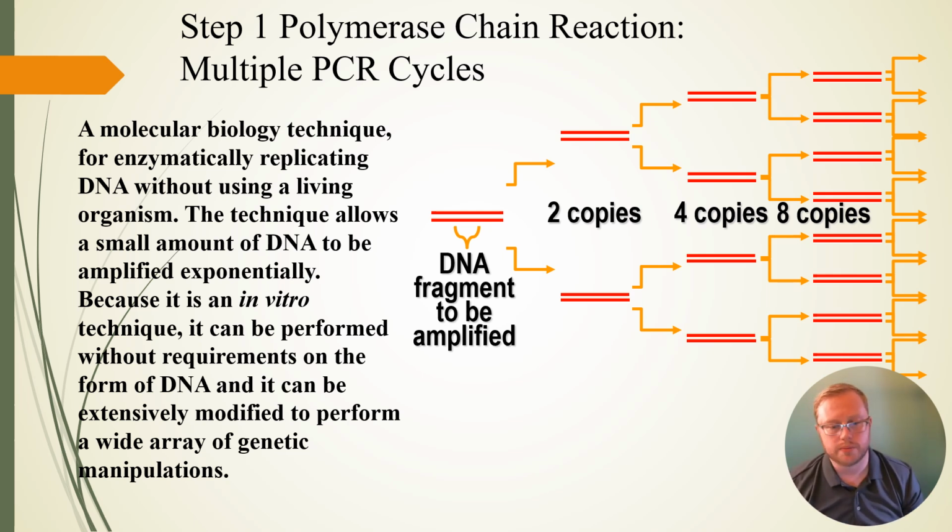This is a molecular biology technique for enzymatically replicating DNA without using a living organism. The technique allows a small amount of DNA to be amplified exponentially. So it means it keeps going up and up and up, and the rate that it goes up keeps getting bigger. Because it is an in vitro technique, it can be performed without requirements on the form of DNA, and it can be extensively modified to perform a wide variety of manipulations.